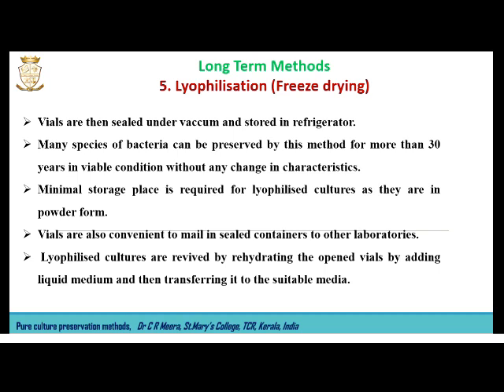This method is very effective in maintaining different types of bacteria, and culture can be maintained in the viable condition without any change in its characteristics for more than 30 years. As the cultures are preserved in this method in small ampules, only minimal storage place is required for maintaining these cultures.